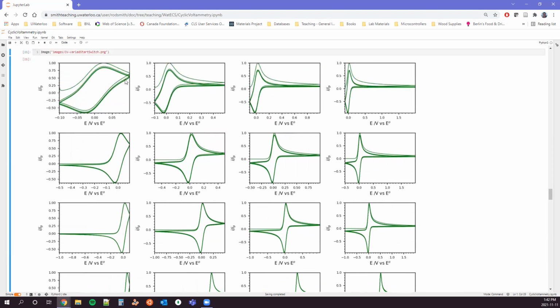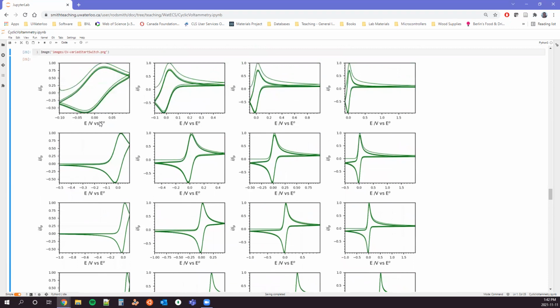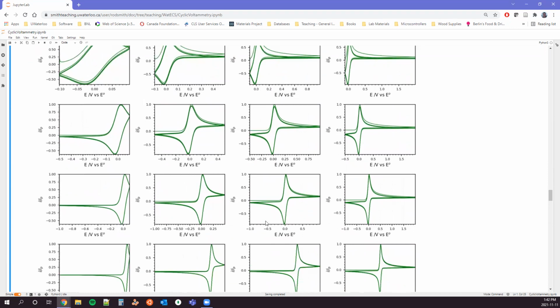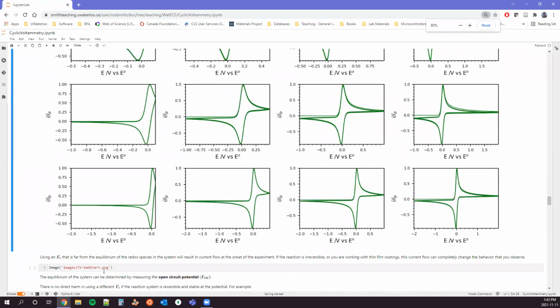If we go closer and have very close to the edge here, our diffusion currents are dropping dramatically. And so what we see over time is that there's a lot of variation in those peak intensities, right? The lesson here is that what you really want to do is try to push it as far away from the peak as you can without causing unwanted chemistry to happen, right? If we go down into this middle region, for example, we see nice stable behavior. The key is, again, that we don't want to see anything irreversible starting to happen there. But that'll give us nice predictable behavior.